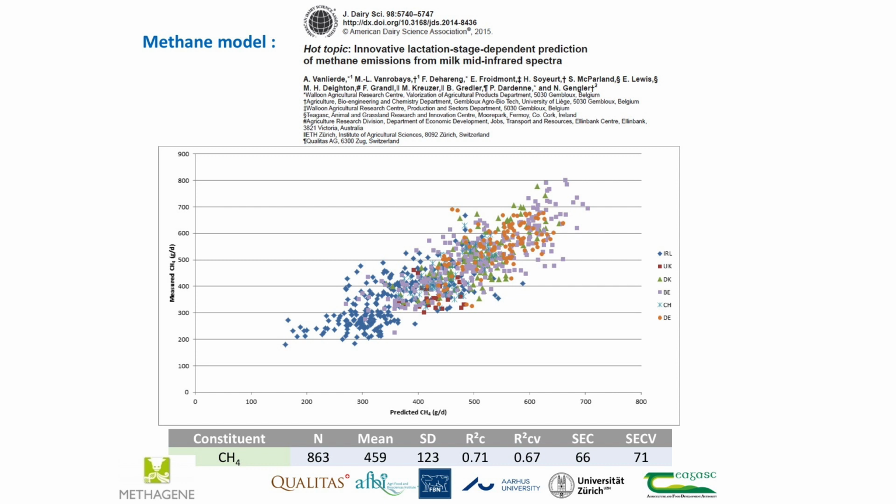It's a model that we created to predict the methane emission by the cows. In the very beginning, we only used results from Belgium, from the Walloon region. And we tried to organize different experiments to enlarge our variability. But by using different reference analysis coming from another country, from Ireland, we saw that we didn't cover, in reality, the whole range. We discovered that in Ireland we had cows with lower emission of methane, due to the fact they used a lot of pasture in this country, and also they use a different breed.